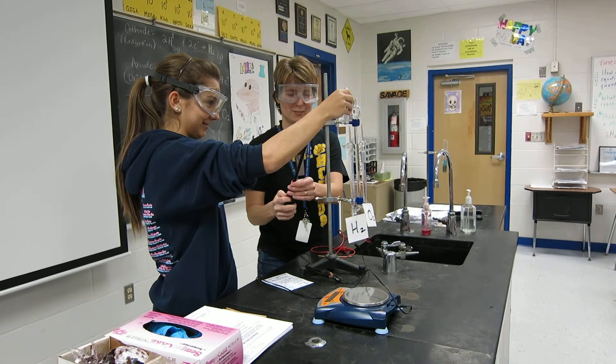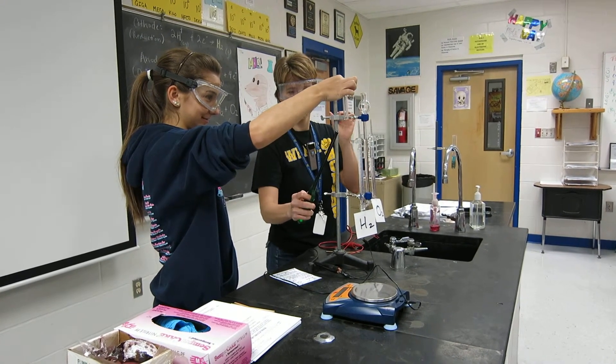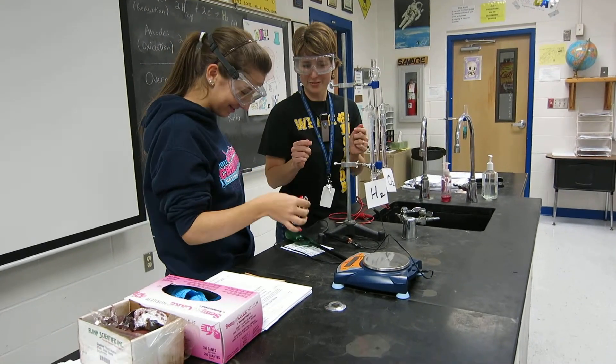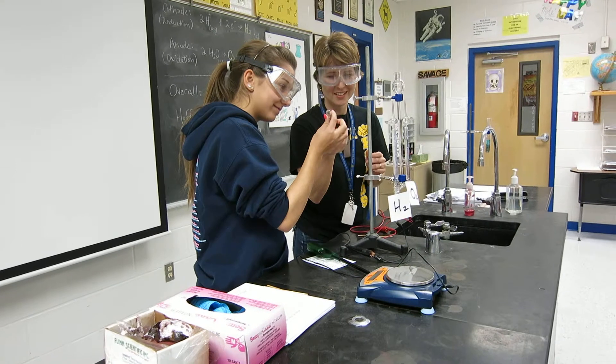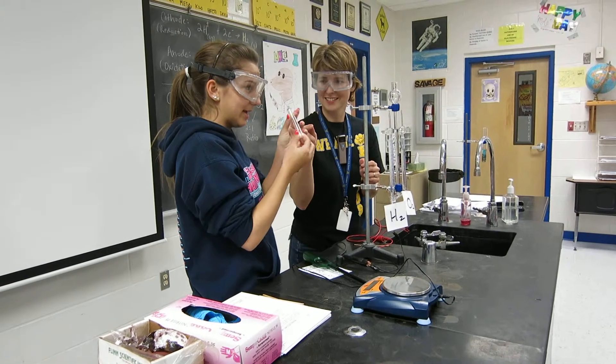Do you want to pull it away? A little bit there. Now just pinch it with your two fingers there — there you go at the top. One, two, three. Now over here though, we're going to test the oxygen. Before we test the oxygen, can you tell me what you see on the inner walls of the test tube? Condensation. Yeah, condensation.